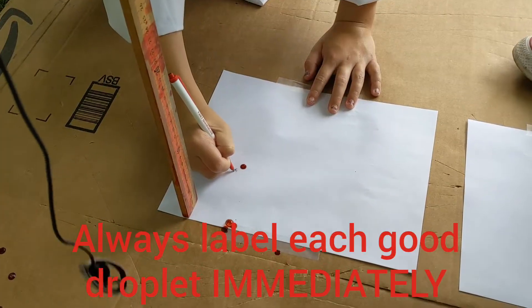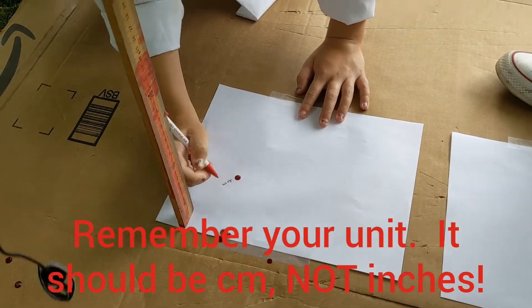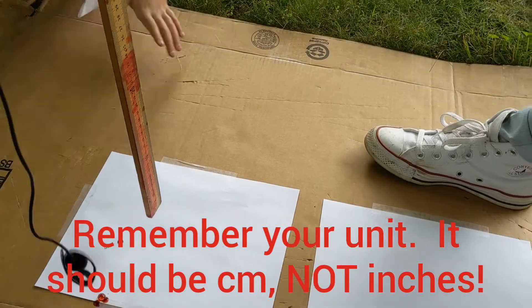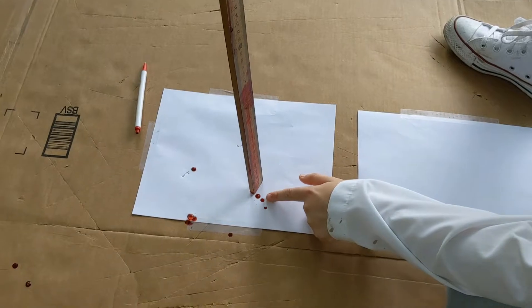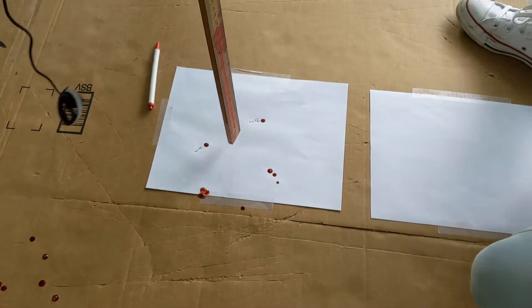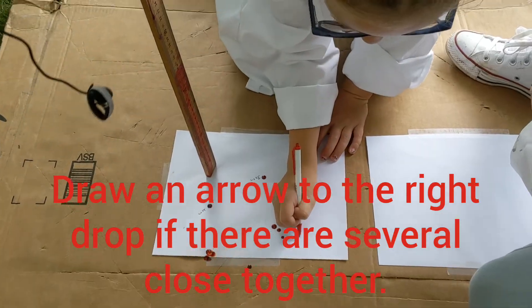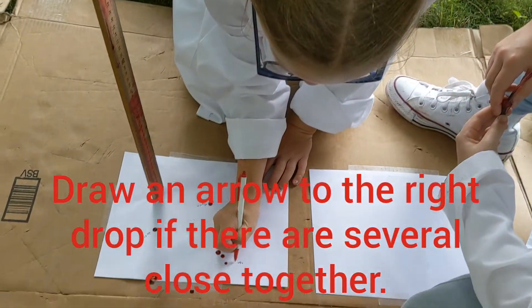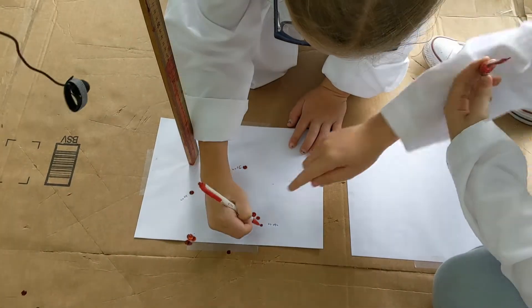Taylor's going to record the height. Excellent. Now try a different height. Was one of those a good 40? Yeah. The smaller one was the good 40? Uh-huh, because that one has a bubble. Okay. Now, Taylor, maybe draw an arrow to the one she thinks is the good one. I think it's the in-between one. Yeah, it's that one.